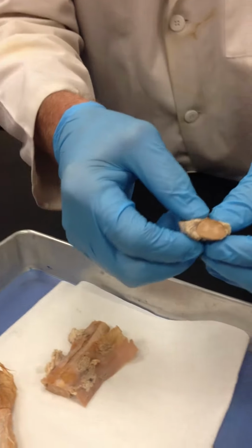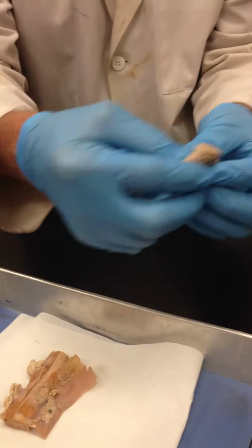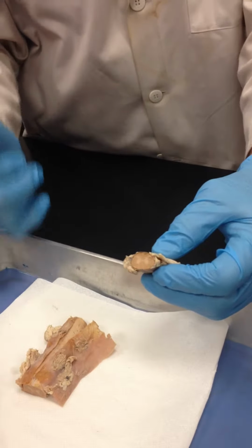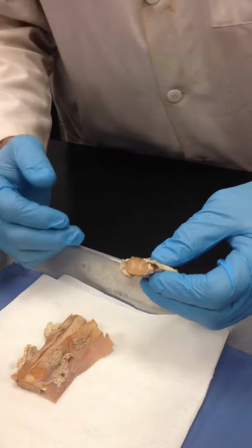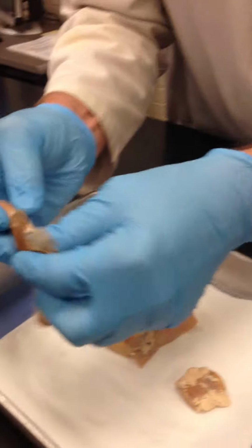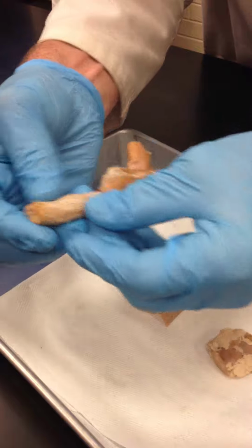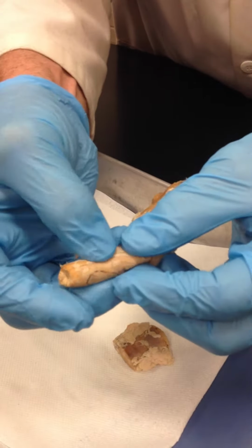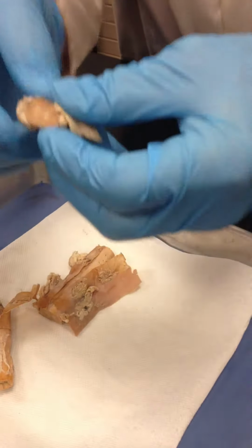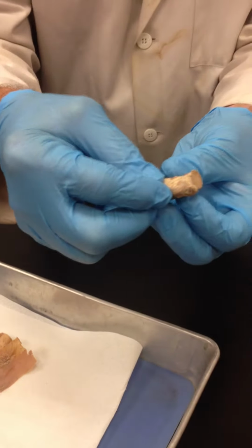Now this material has been preserved in fluid for some period of time, so the colors are a little bit skewed, but white matter is always on the outside, gray matter is always on the inside in the spinal cord of a mammal. Likewise, we can see meninges here, as well as the pia mater closely bound. That's a pretty good place to see it. You can see the pia mater, very thin, delicate membrane. And we know that central to the gray commissure is where we would find the central canal itself.